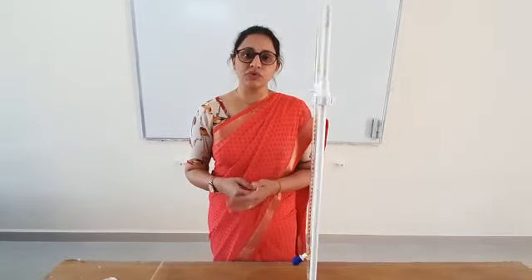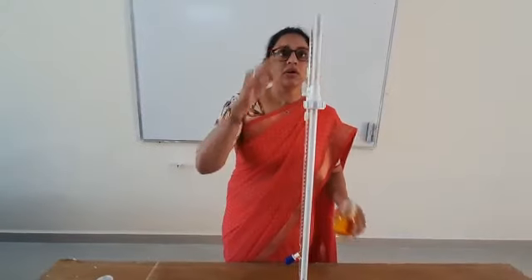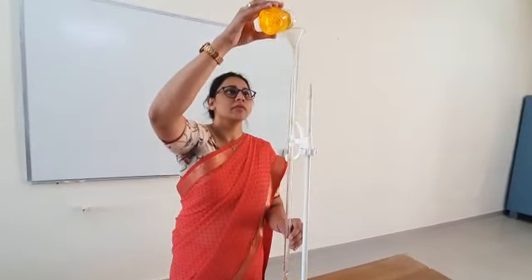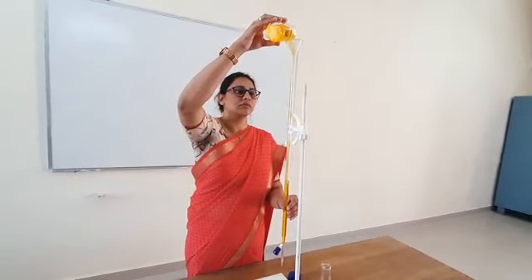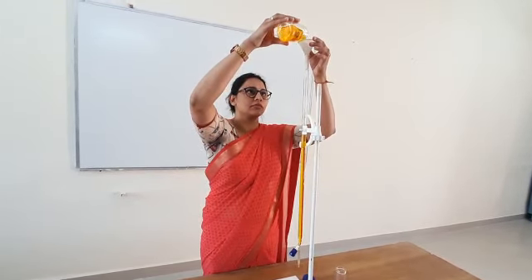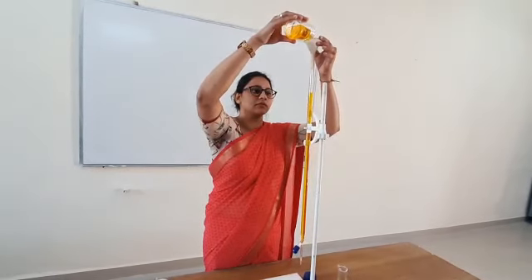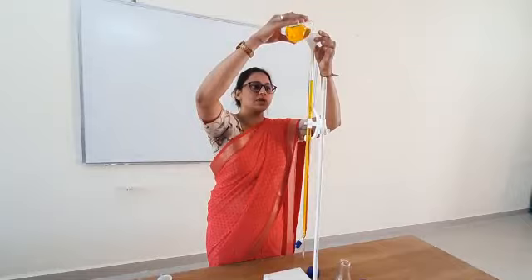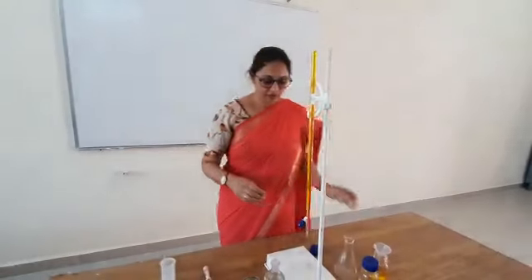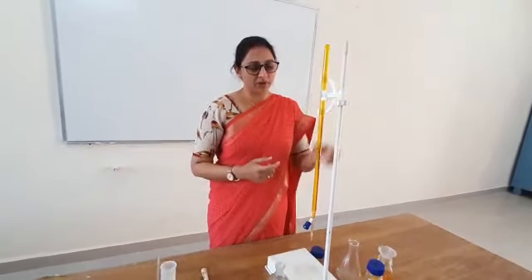Let us start the determination of ferrous ammonium sulfate using the internal indicator diphenylamine. We will fill the burette with the help of a funnel and add potassium dichromate solution. Since it has a colored solution, we will check the upper meniscus. The burette is filled and the knob is closed — 50 ml of potassium dichromate is added.